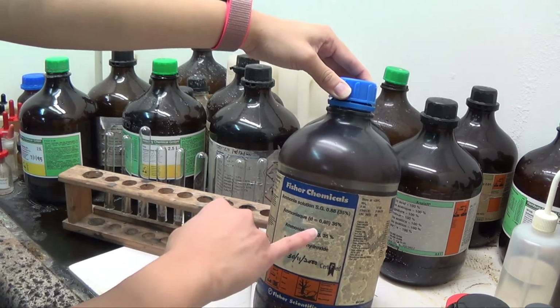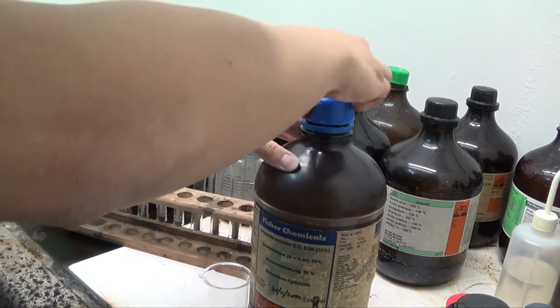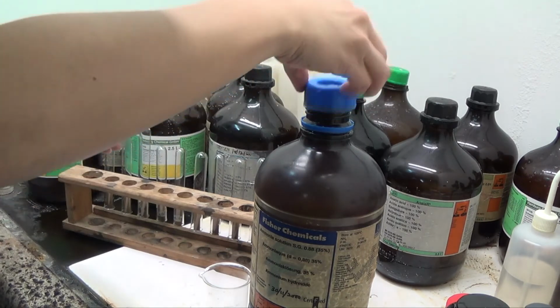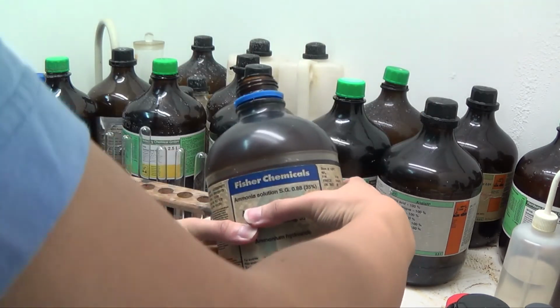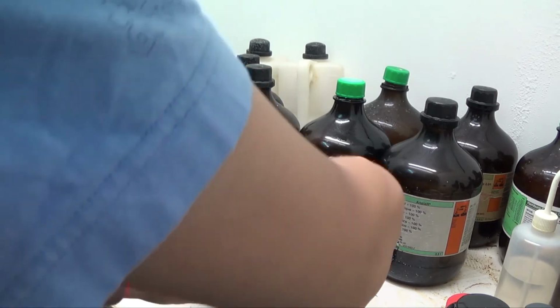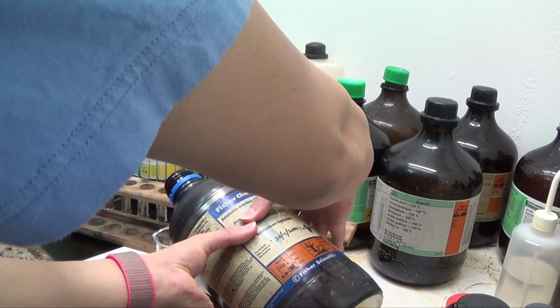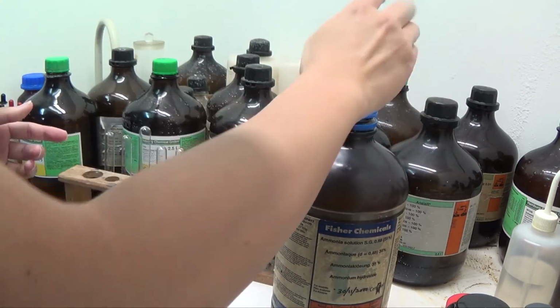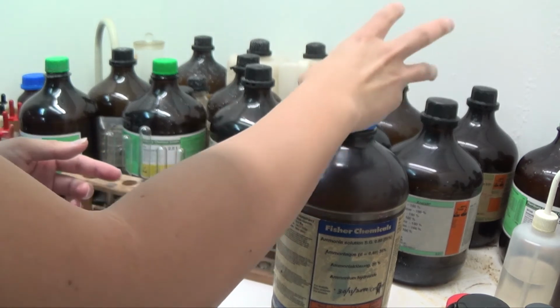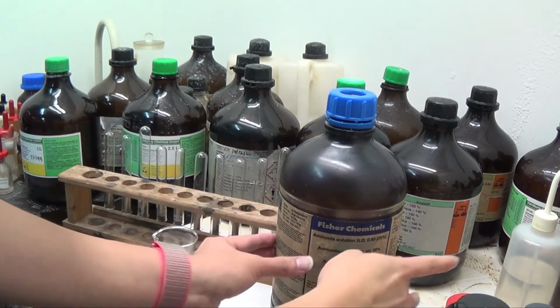So what we have here is a very concentrated, 35% ammonia. Despite its high solubility in water, it does fume off to give you this really pungent gas, which is ammonia gas. I don't need a lot of it. It is a corrosive solution, obviously, so I should have used a nitrile glove, which is a chemical resistant glove.